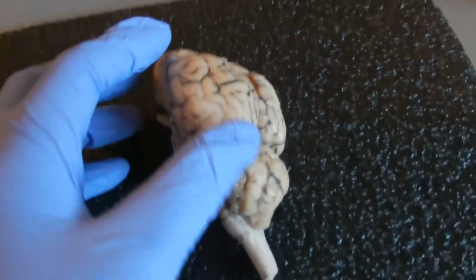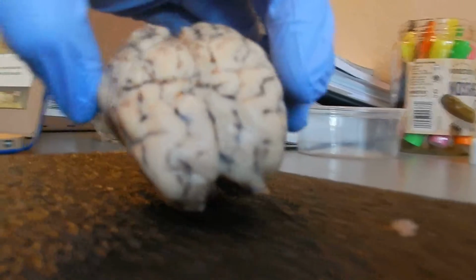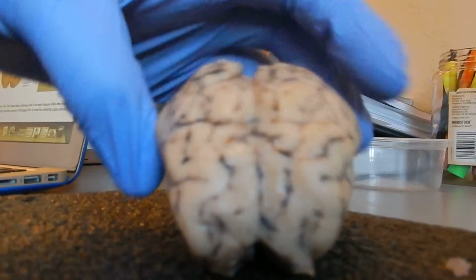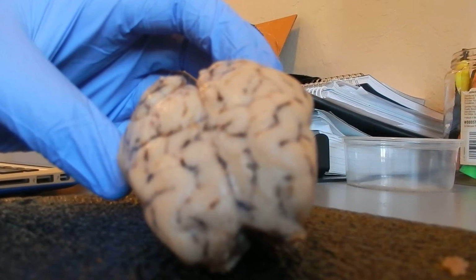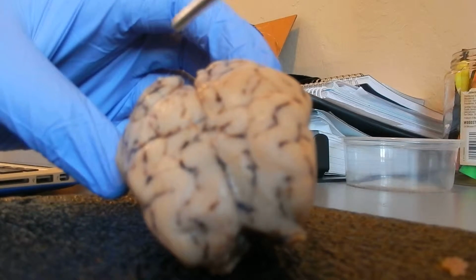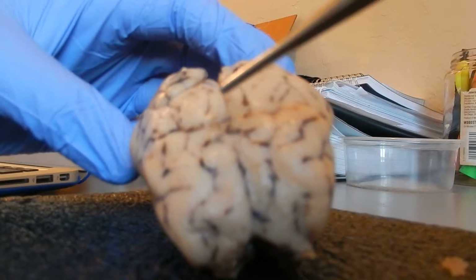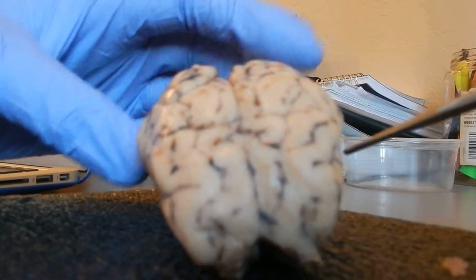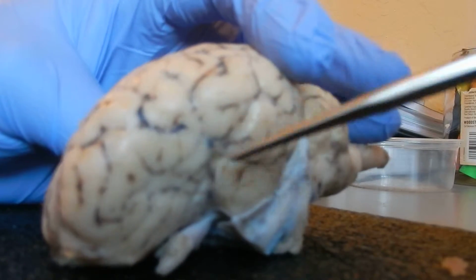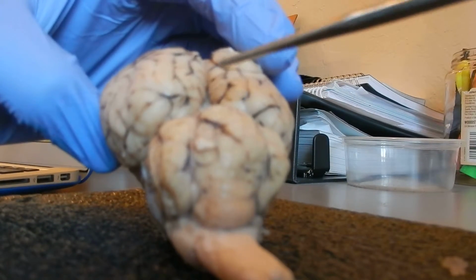Today we're going to be doing a dissection of a sheep's brain. So the first few things that we should know about the sheep's brain are where the areas are specifically of the sheep brains. For the sheep brain, we have the frontal here. We have the parietals here, temporals here, and turn this around, we have the occipital here in the back.